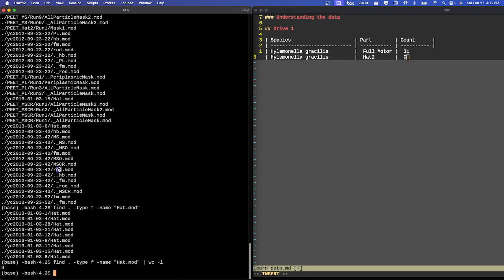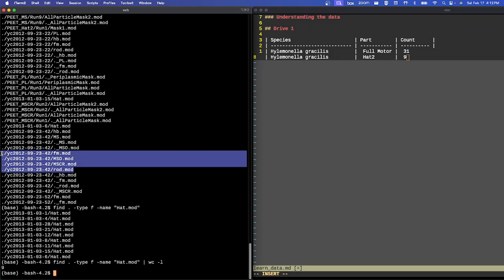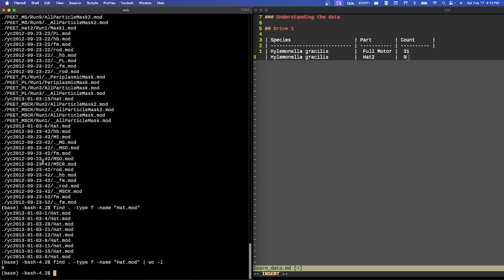What does that mean? So this would be actually a pretty similar one. I could probably just figure this out right now, but we just have to use imod to pull up the rec file and then look at both of these, locate what's going on, where is it pointing, is it just that you can only see? Yeah, so we have to figure that out. I'm just curious about that, but mainly I just want this table completed.